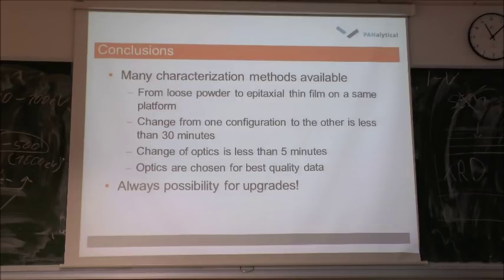And then you can choose different optics according to the quality that is needed. And actually, due to these changes, it is also possible that you can upgrade your system afterwards. Let's say, if there will be a need, we can go to 4-bounce crystal. It's just a question of money, that you have to buy one more of these solid pieces.